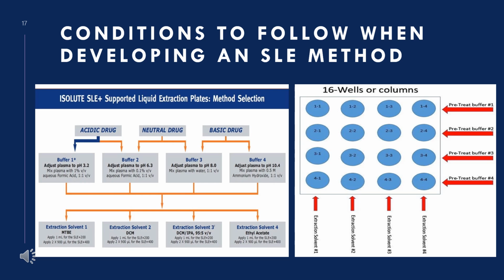And the purpose of this sample pre-treatment is to promote partitioning of analytes into the organic phase. The charge on any acidic or basic group should be suppressed wherever it is possible, and this is particularly important for the polar analytes. And if you are doing a panel of more than one drug type and want to find the overall optimal conditions for a single method, then this tactic can be a wonderful tool for you.